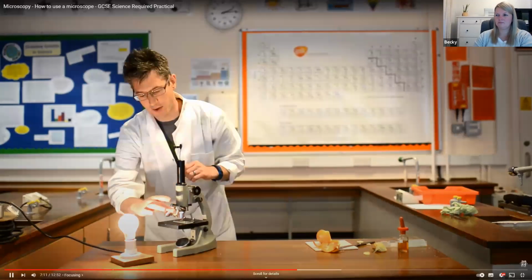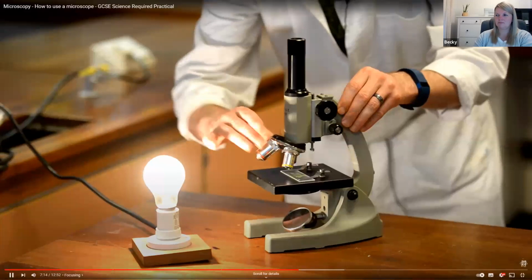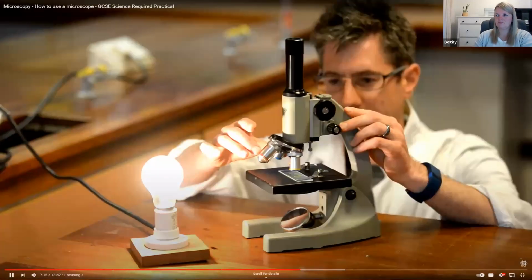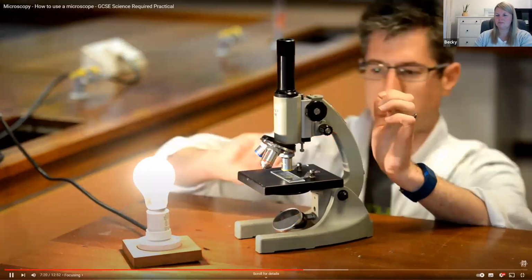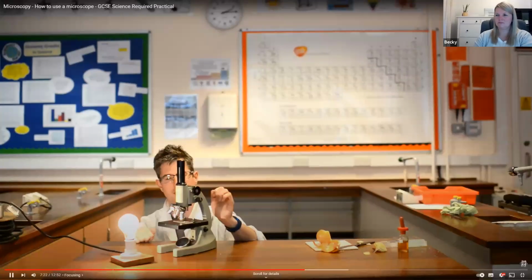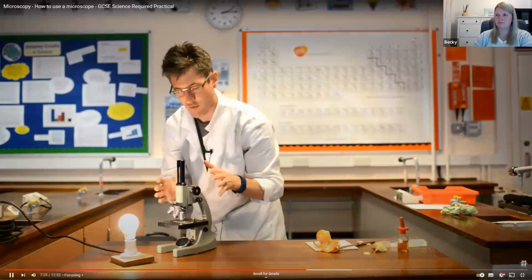To do that, all you need to do is spin the next objective in, get down low, and make sure it's not going to touch your slide. Again, there's lots of space there, so they're not touching, and it's not going to damage the lens or the specimen. It should roughly still be in focus.